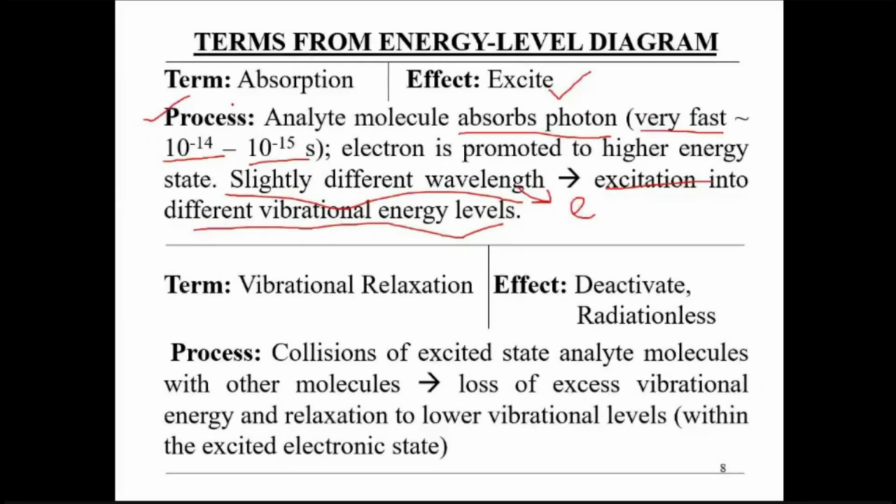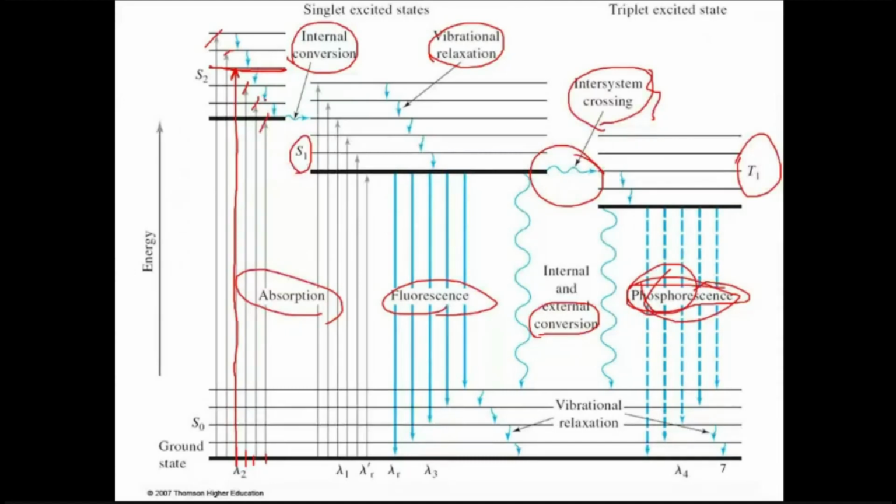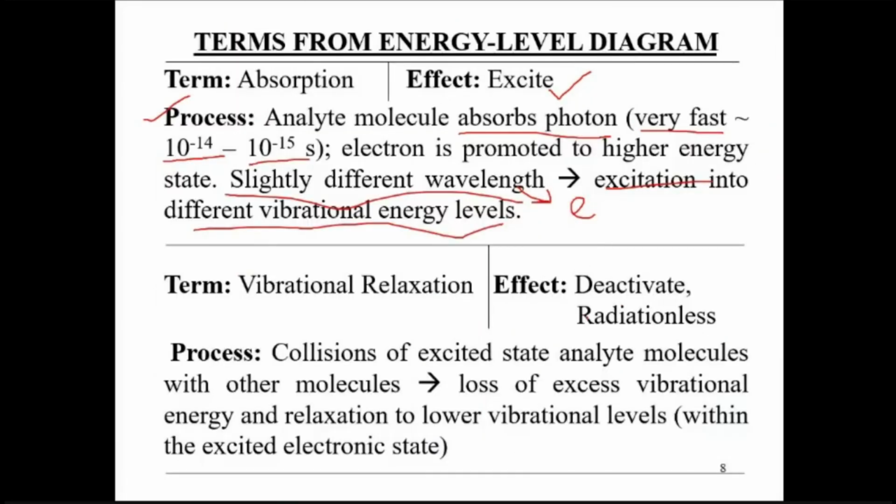When we say vibrational relaxation, we are looking at these processes, the small blue colored arrows. So what is the effect? The effect is deactivation, and it is a radiationless process. What occurs in the process?